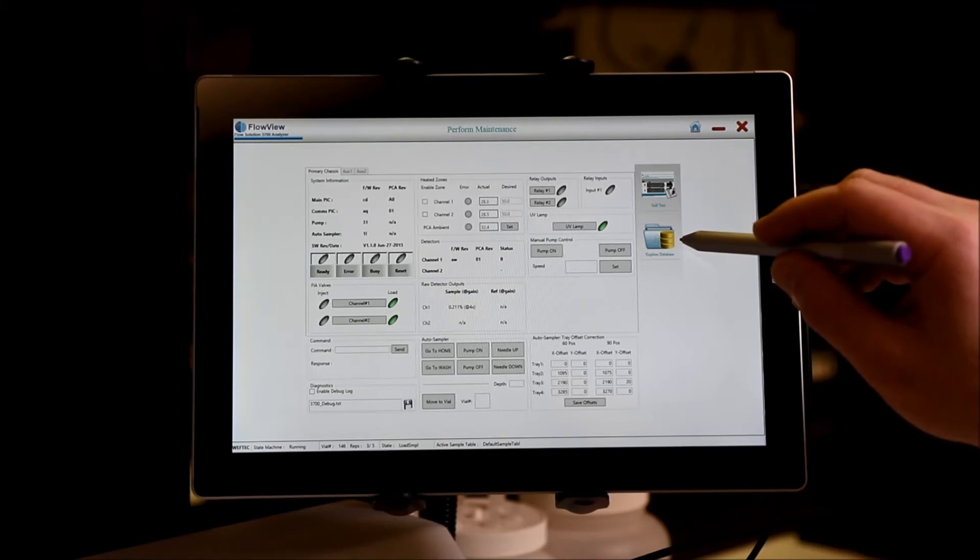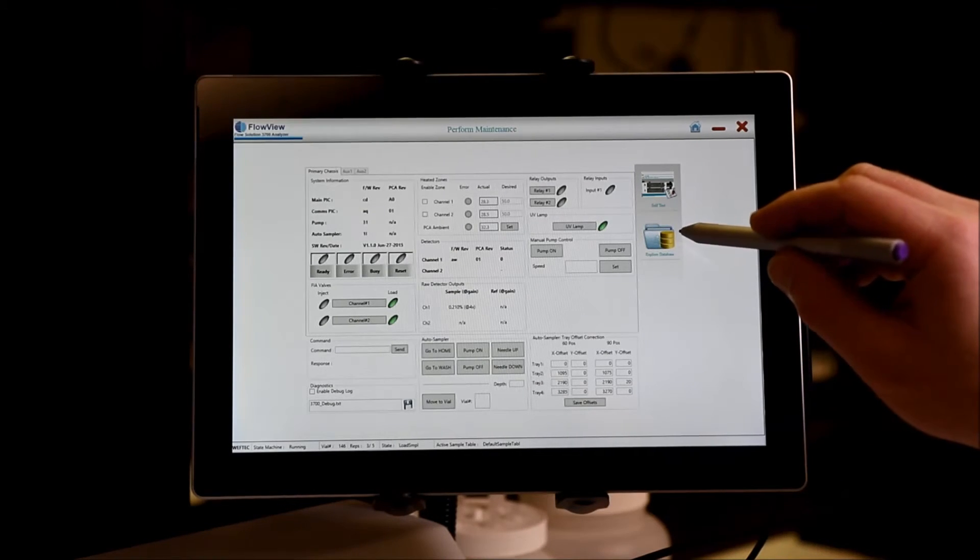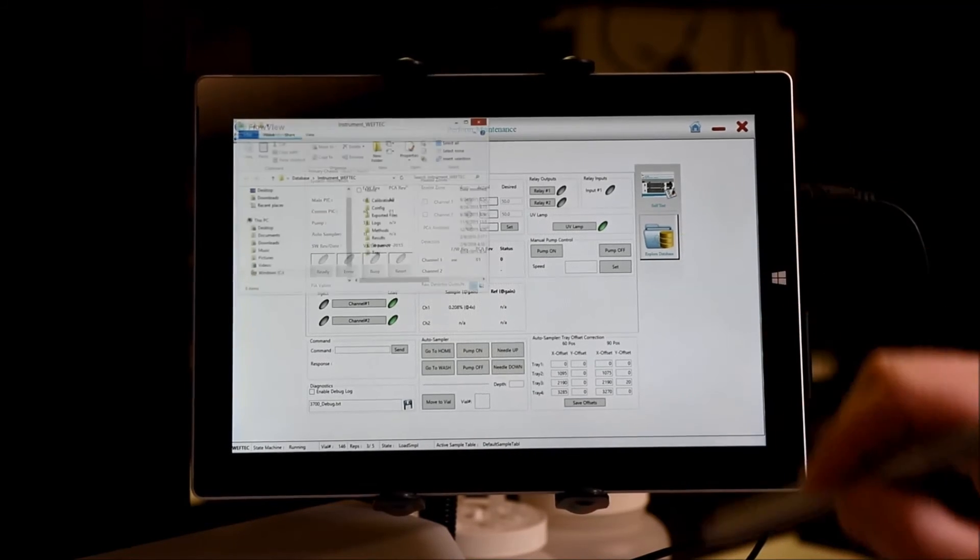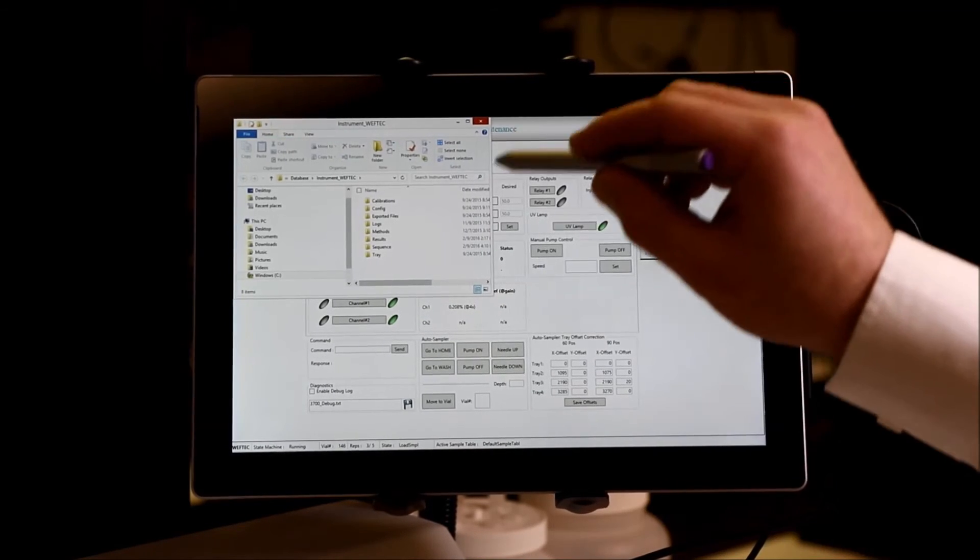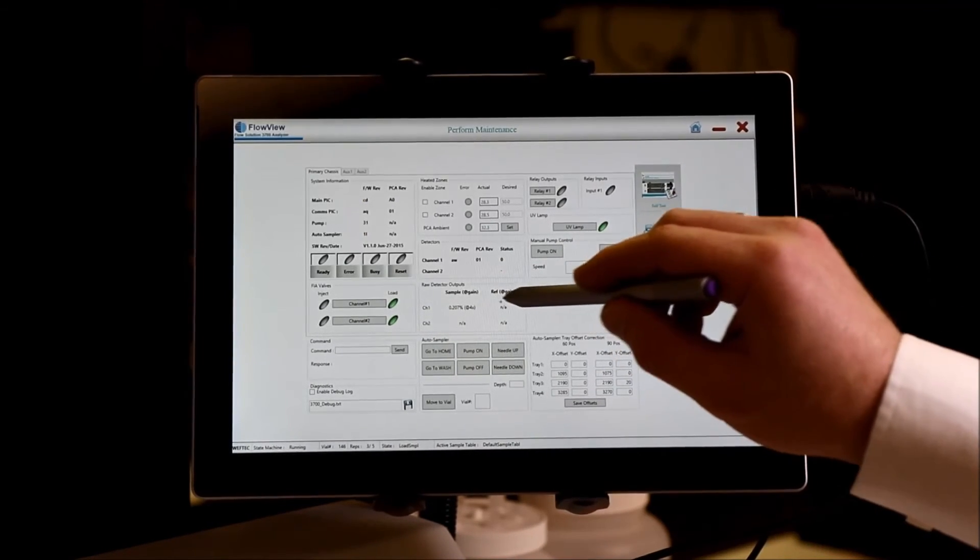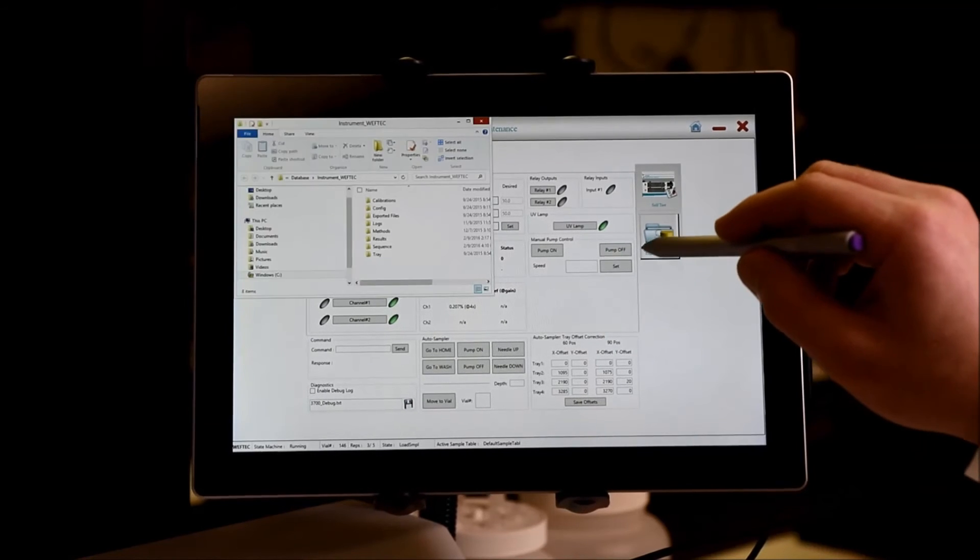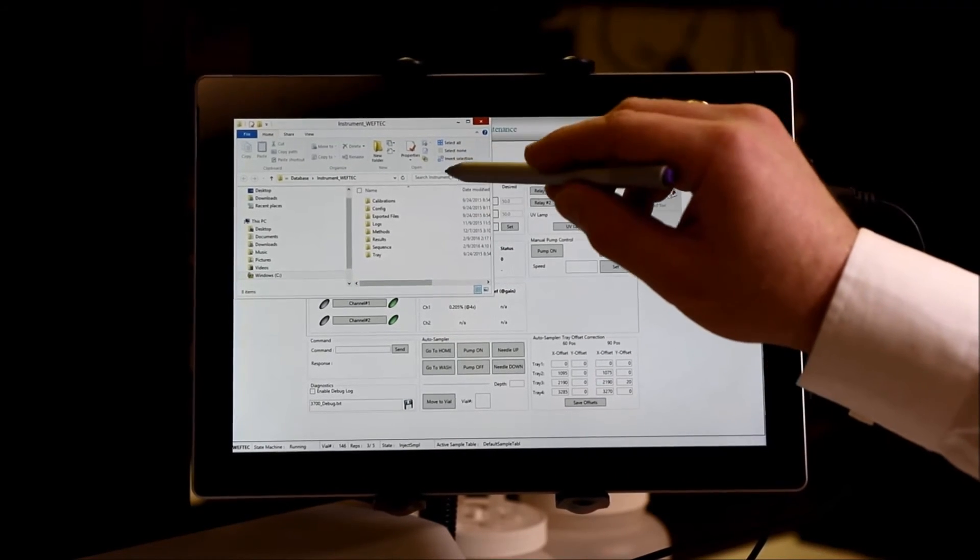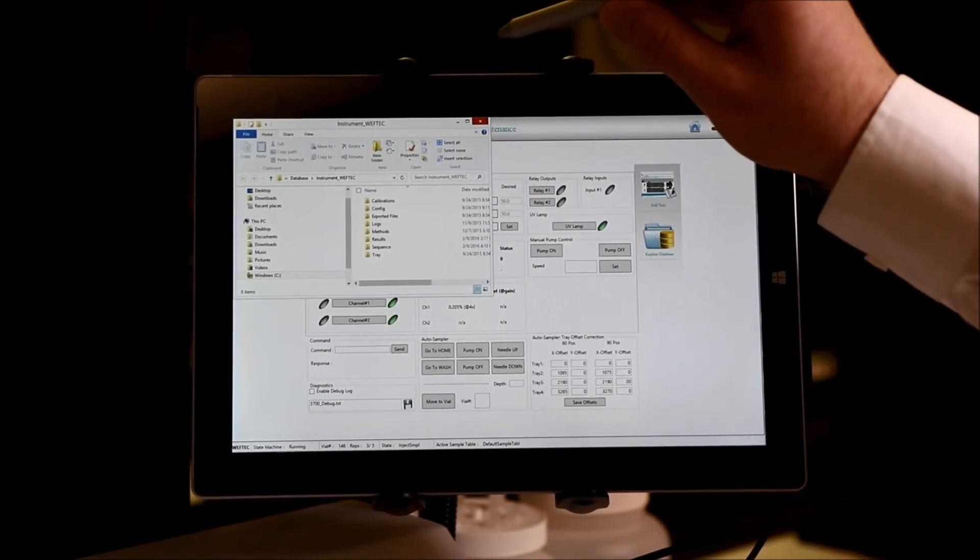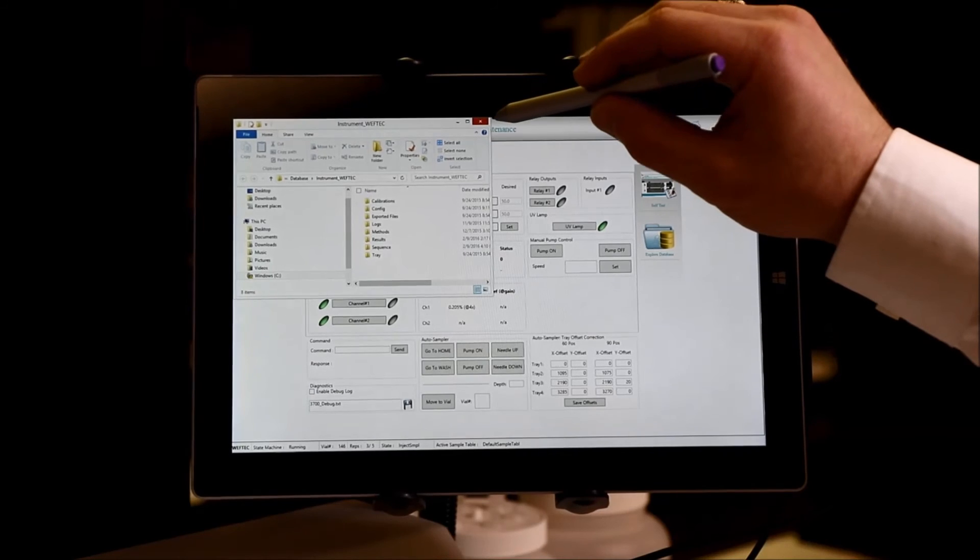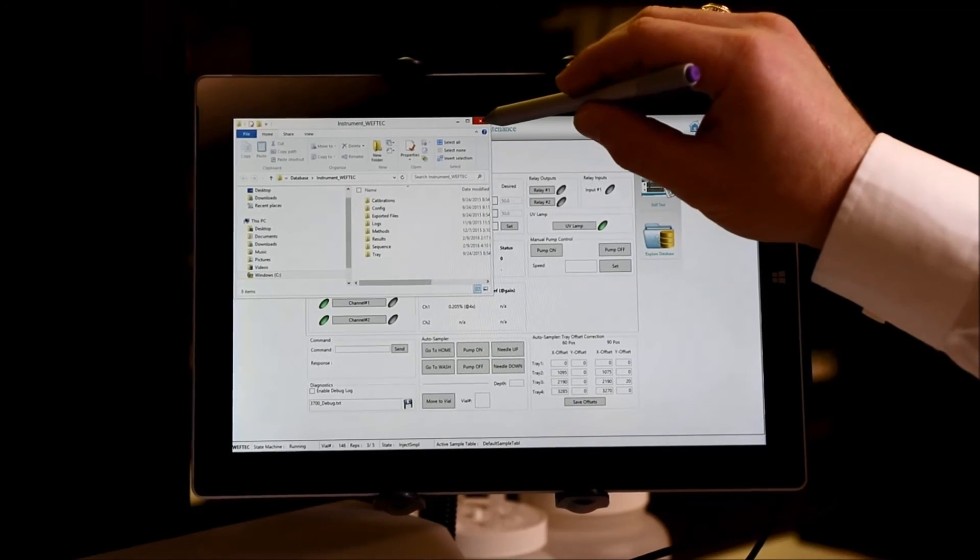Lastly, as an easy way to access any of the data stored by FlowView, you can click the Explore database, and it will go immediately into the directory where all of the methods, results, and sequences are stored.